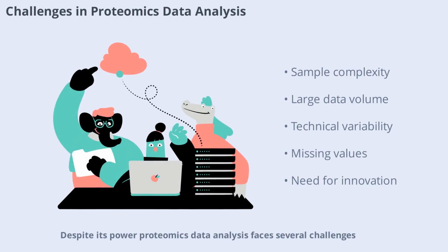Despite its power, proteomics data analysis faces several challenges. These include sample complexity, data volume, technical variability, and missing values. Addressing these challenges requires careful experimental design, advanced analytical methods, and continuous technological innovation. By overcoming obstacles, researchers can unlock the full potential of proteomics for scientific discovery.